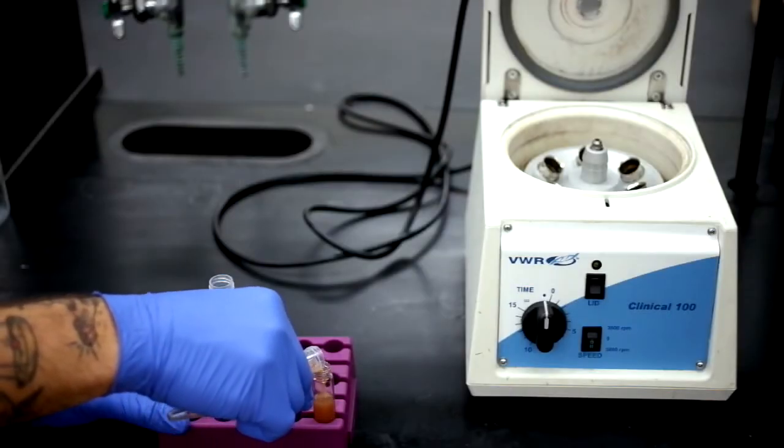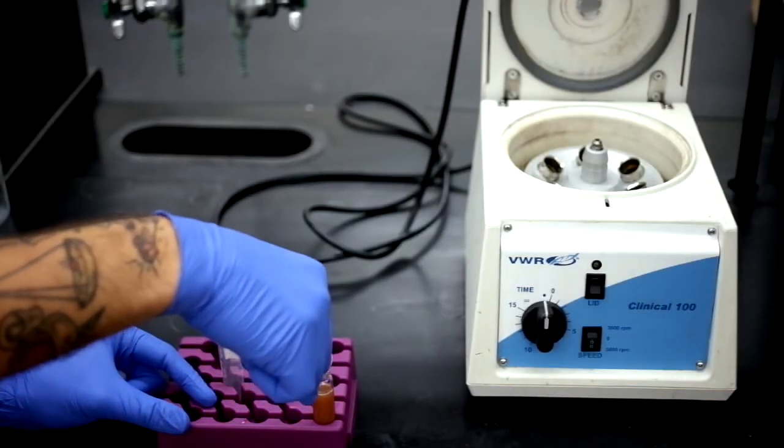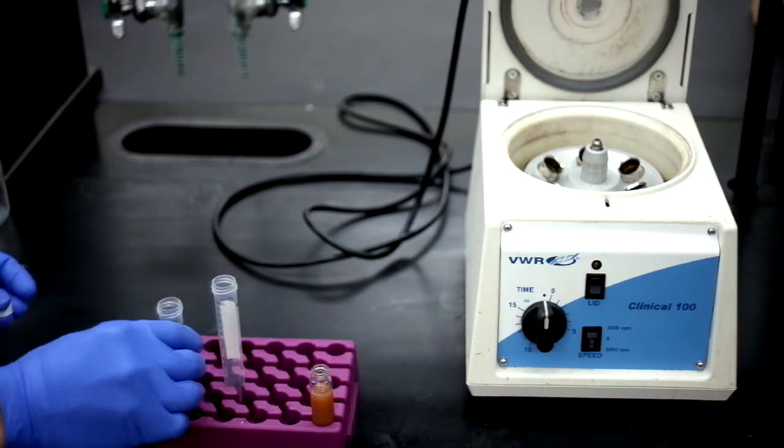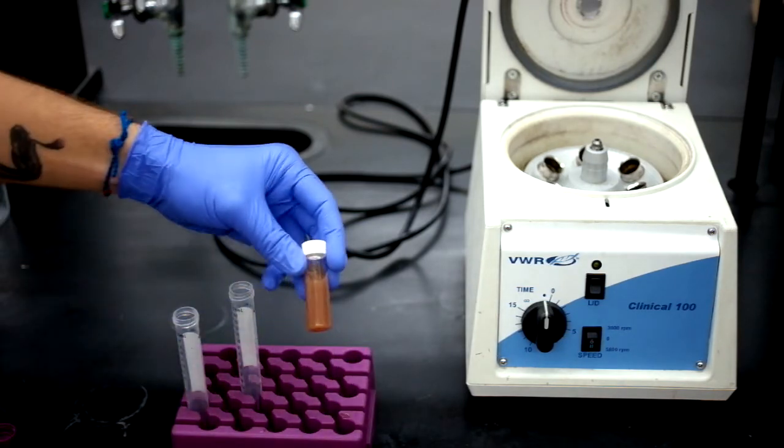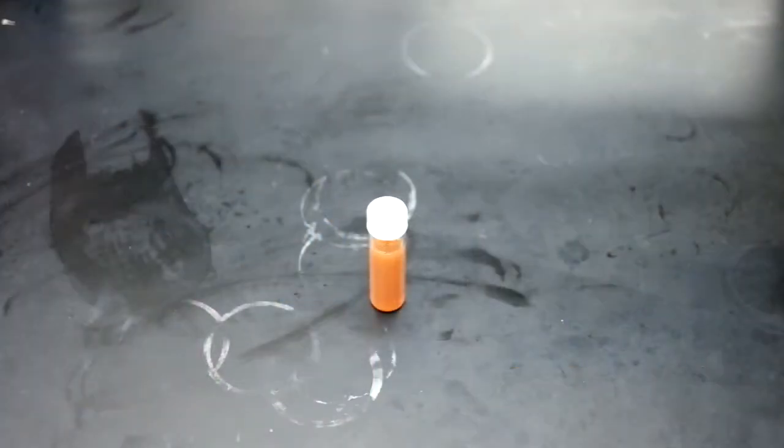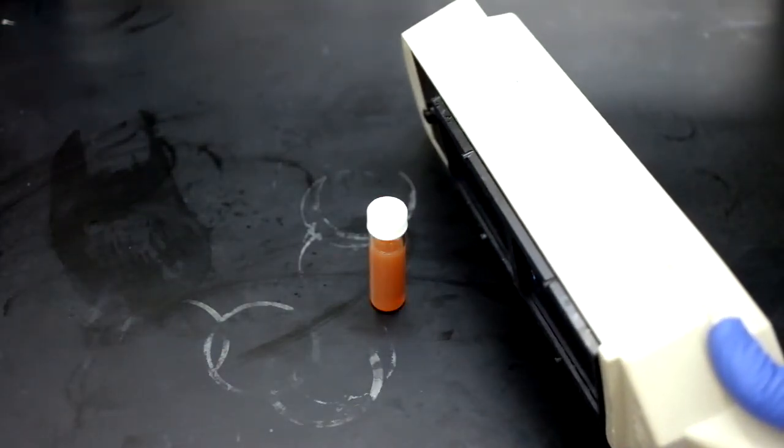We can now store our solution in a closed glass vial at room temperature. The solution may be brown and somewhat transparent, like the one shown in the video, but it may also be oranger and cloudy. If we put the dots under UV illumination, we don't see any fluorescence.